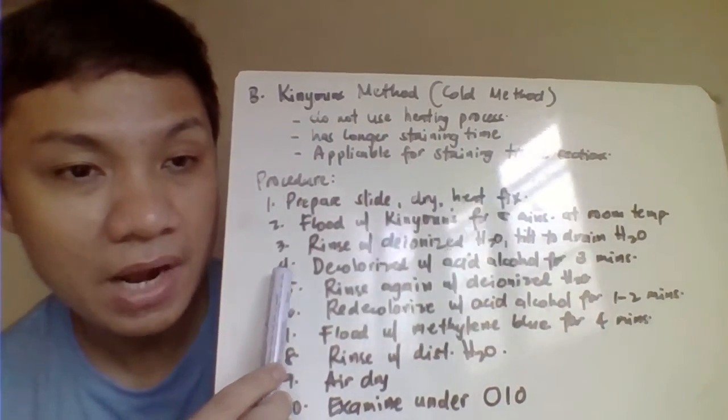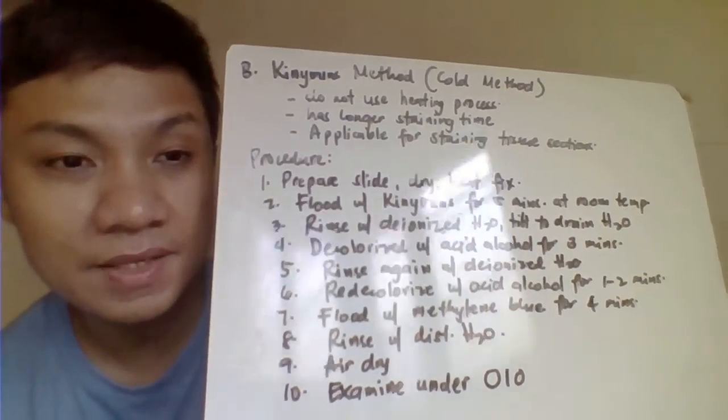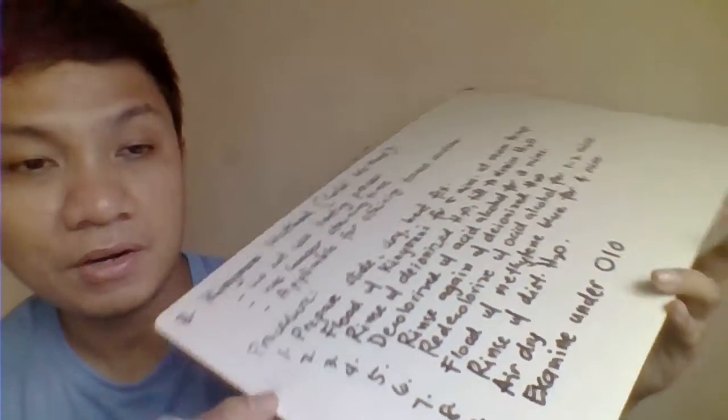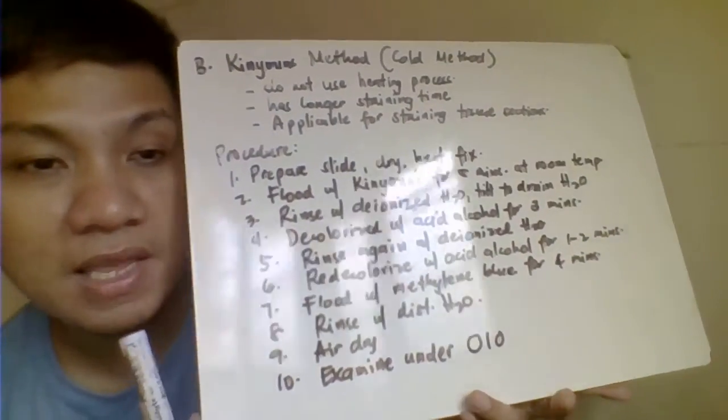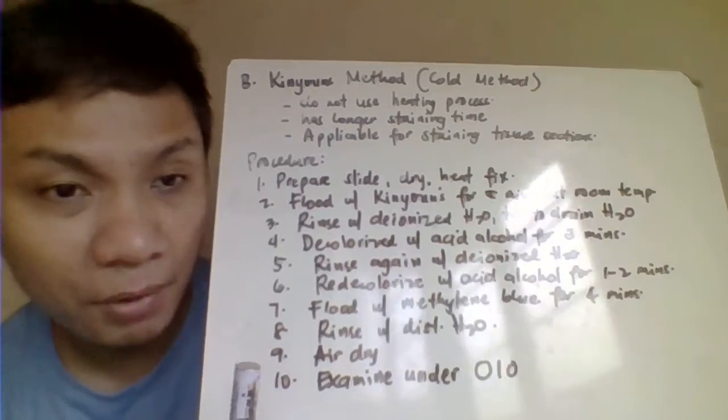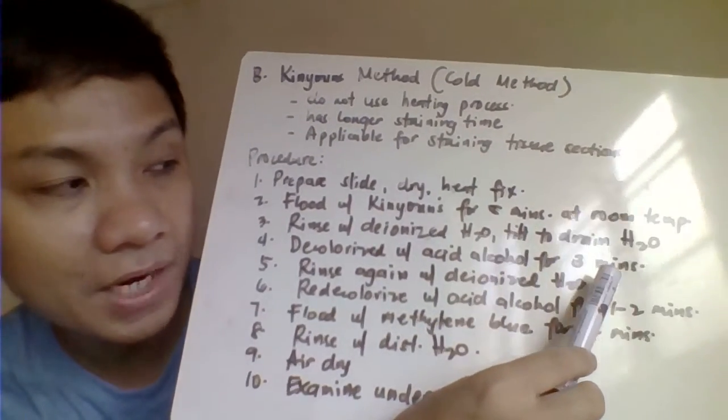And after that one, try to decolorize with your acid alcohol here. Applying here the acid alcohol in your slide. So parang ganun ulit. Titilt mo siya. Magpa-flow lang siya dito sa taas, and that would allow the removal here of your Carbolfuchsin. Para complete removal for decolorization process. That's for 3 minutes.